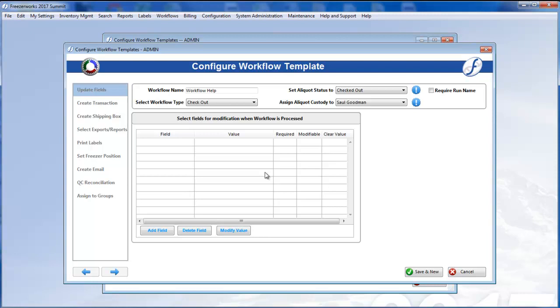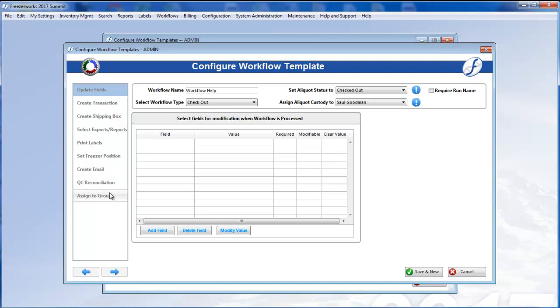Now there are eight configurable tasks available with every workflow. The page buttons along the left side correspond to these tasks and will help you navigate through configuration. Assign to groups, though not a task, is still very important.